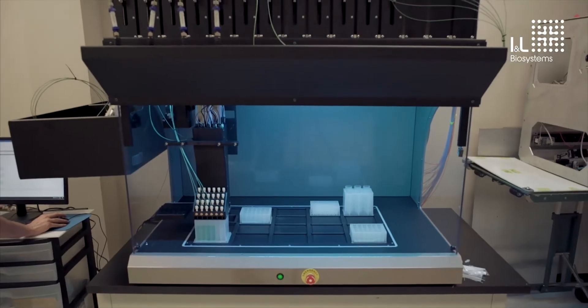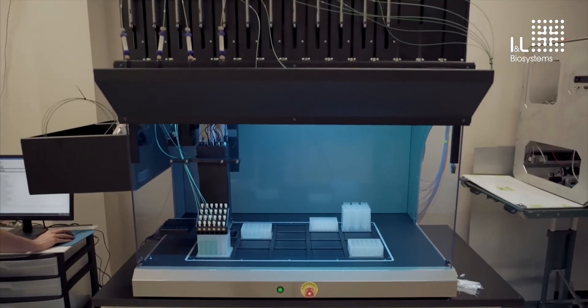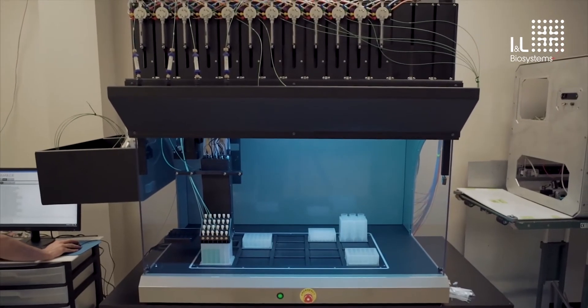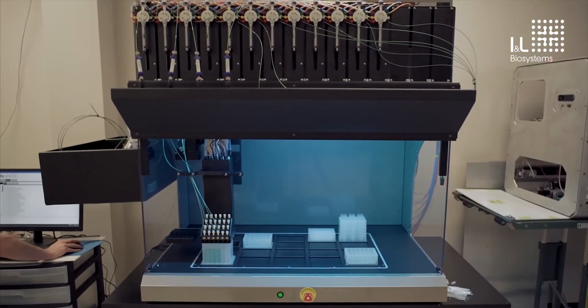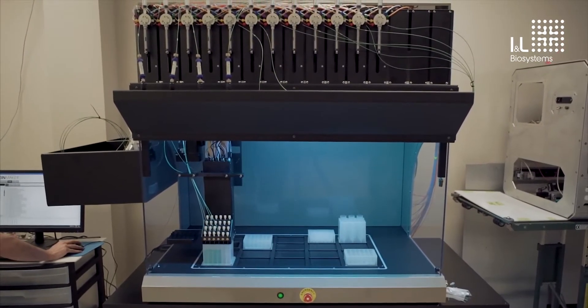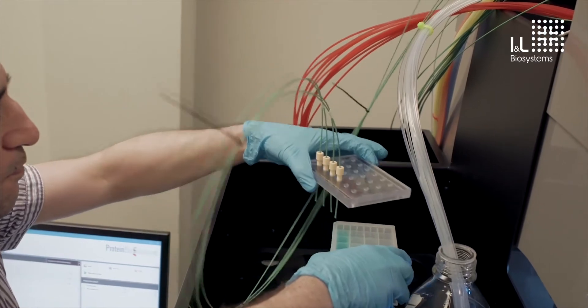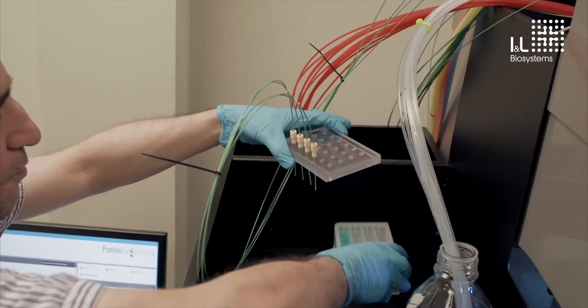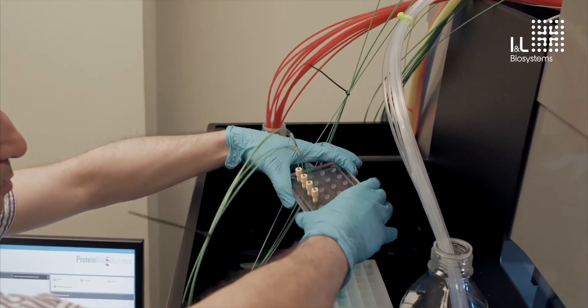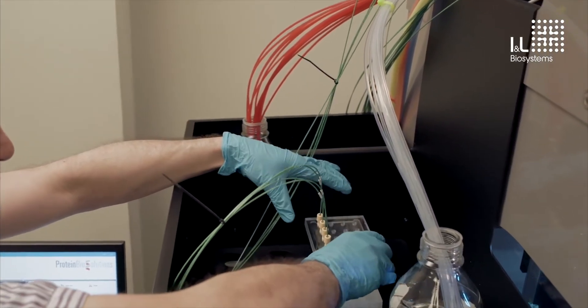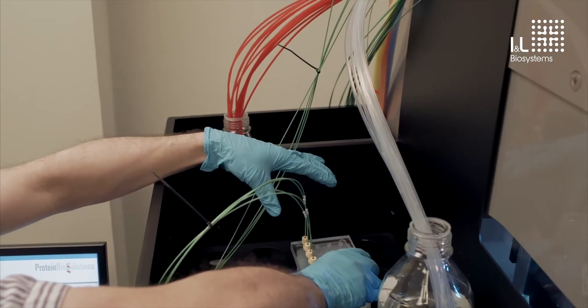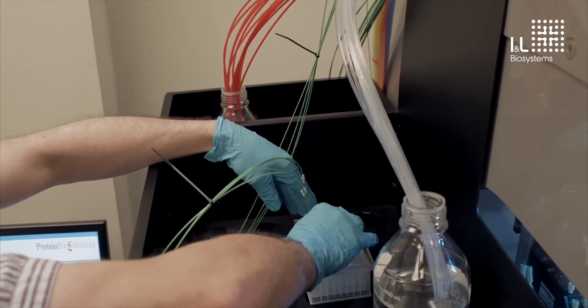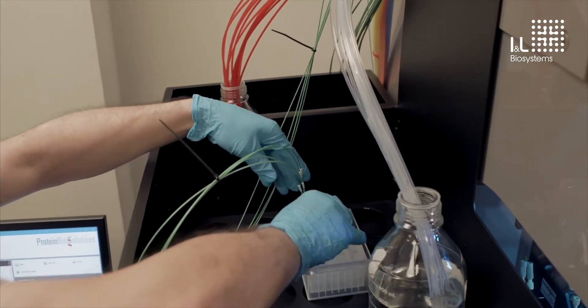Running 24 purifications requires buffer bottles of various types and other containers. We have various shelving options such as this side shelf that can hold bottles of different sizes. Tubings coming in from the 9 port valves can be organized by grouping them together or by securing them in plates like this one.